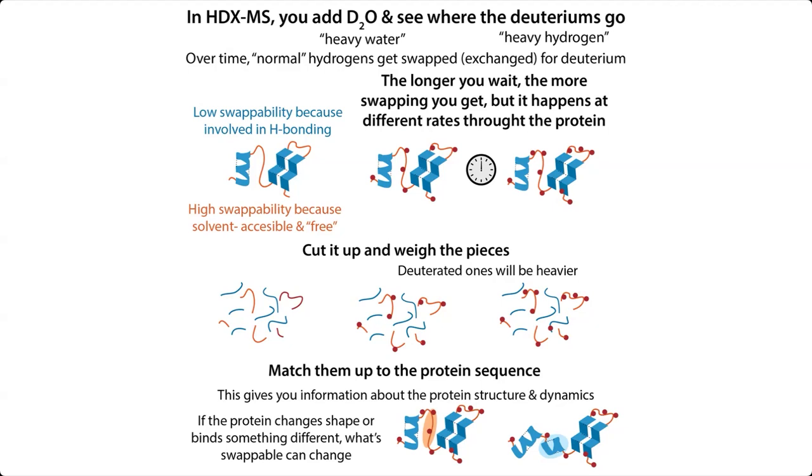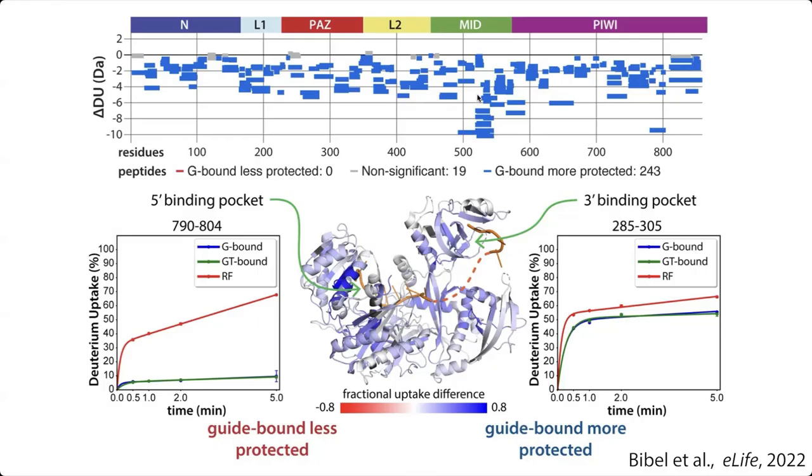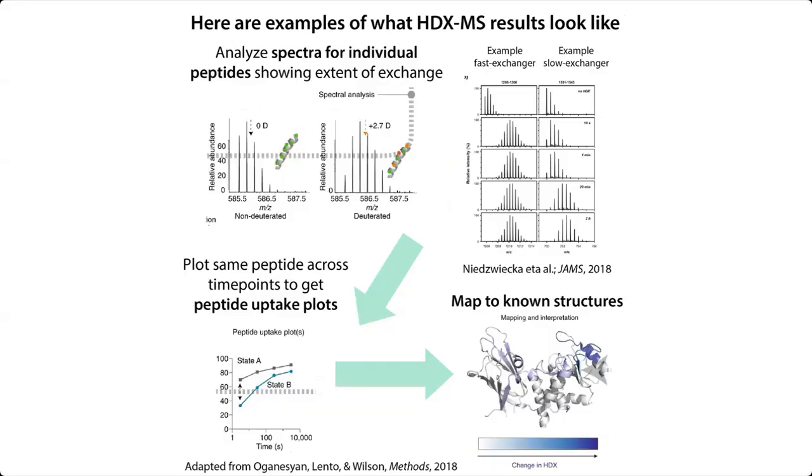And the really cool thing about HDX-MS is that it's in solution, so you don't have to get the protein to freeze, you don't need to get it to crystallize, you get it monitored in its natural environment and look at its dynamics. It's not as commonly used as other techniques, in part because it uses some specialized equipment, but I used it in grad school and got some cool results from it, and so I'll show you that as an example and walk you through how we can interpret this data and what's involved in an HDX-MS experiment, what it can tell you, that sort of thing.